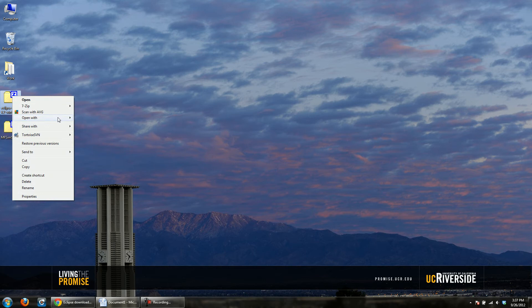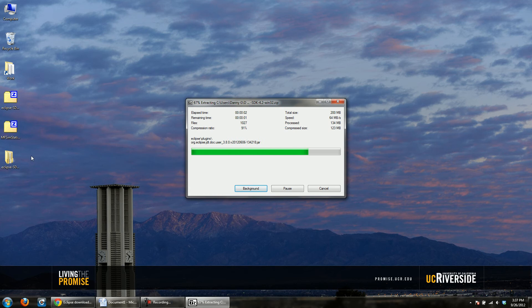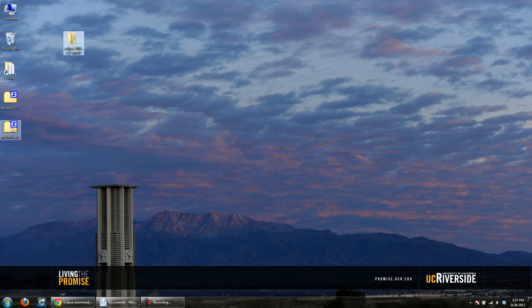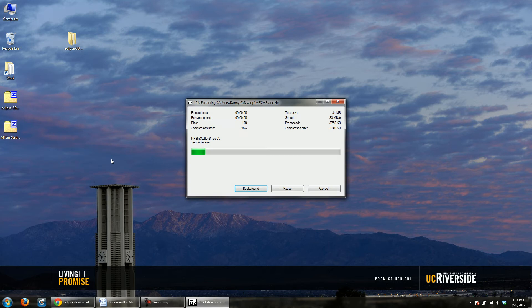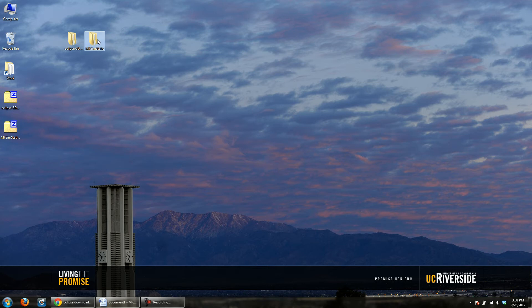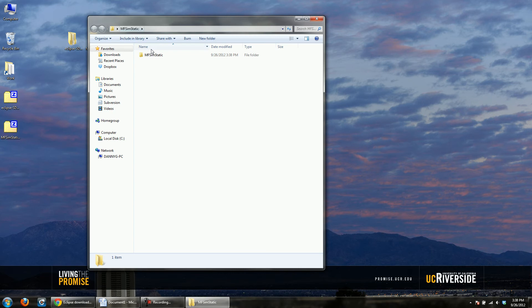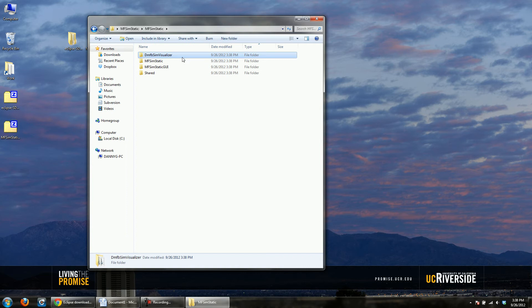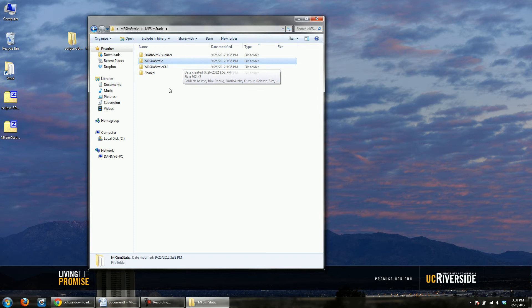Here's a fresh copy — we'll go ahead and extract it. Now this is a fresh zip file of the project as you would download it, so let's extract that as well into a folder. Now we have our Eclipse and our microfluidic simulator. You'll see that it basically has four different folders. The first one, DMFBSimVisualizer, is the Java project which contains the code that creates all the different graphical outputs. MFSimStatic is a C++ project — it's the source code that contains the simulation files.